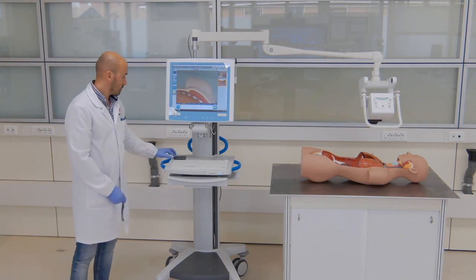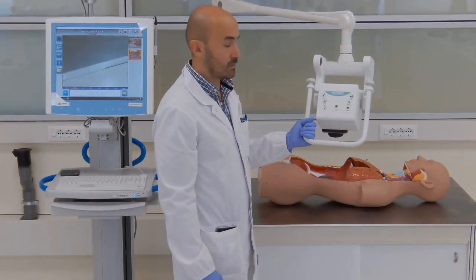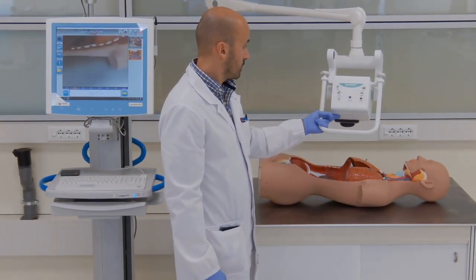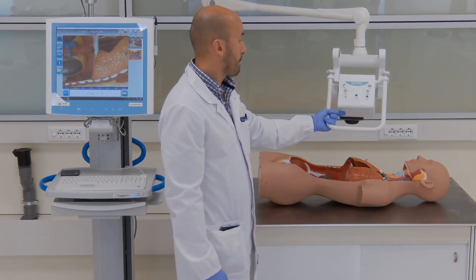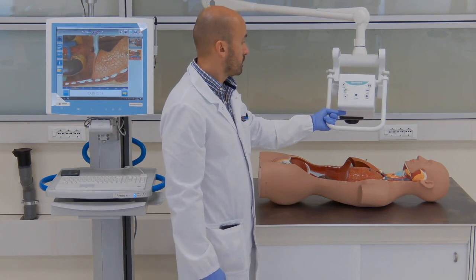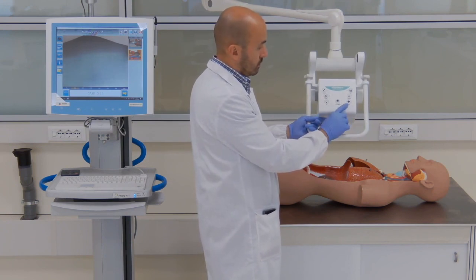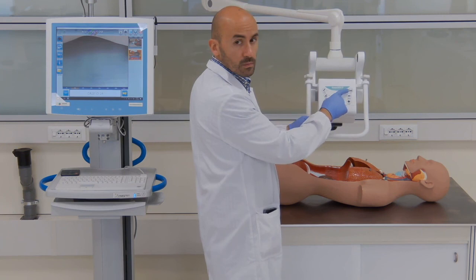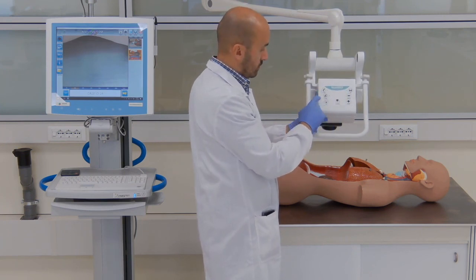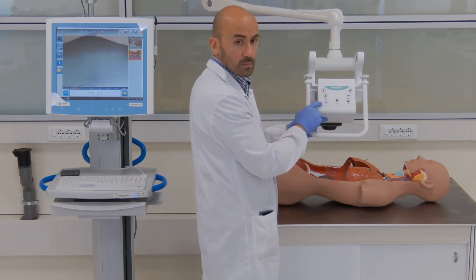A camera is mounted on a swing arm. The camera is built in a manipulator that contains all the functions necessary for the documentation, such as zoom in and zoom out, save image button, audio and video recording. A spotlight can also be used.